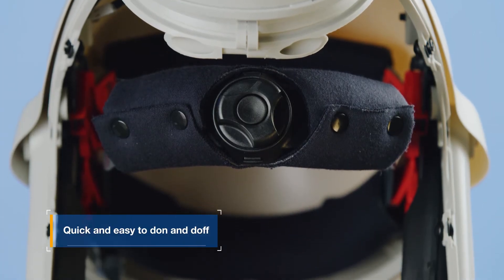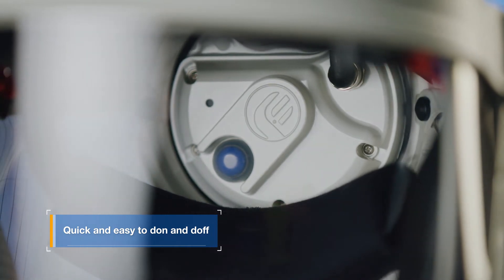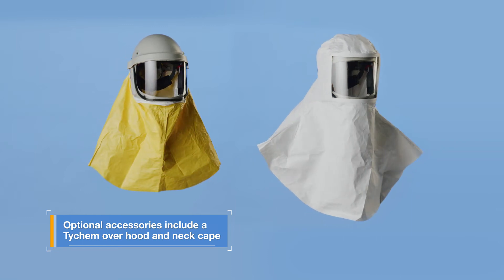The unit comes ready to use straight out of the box and is quick and easy to don and doff. Optional accessories also include a Tychem overhood and a Tychem neck cape.